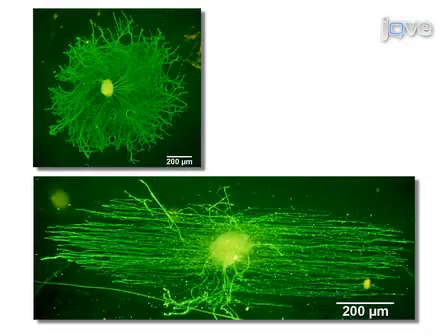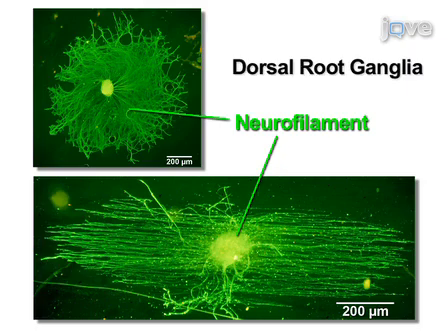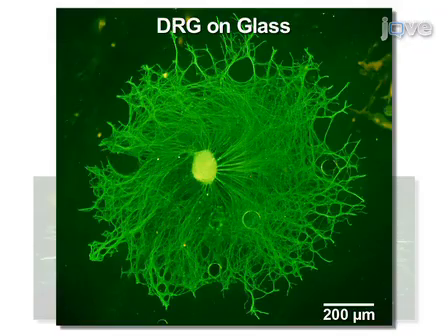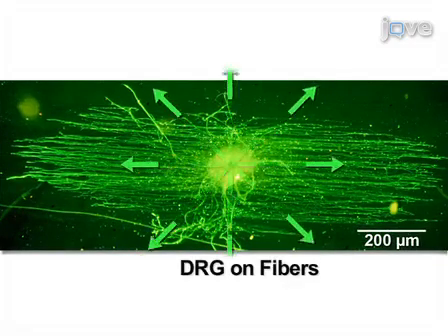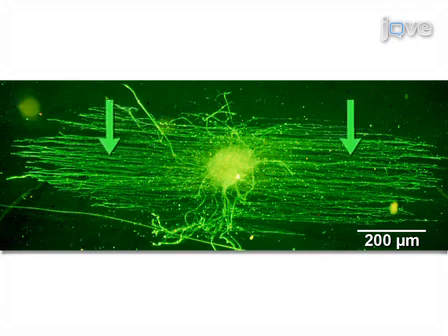In these images, dorsal root ganglia are stained for neurofilament, shown in green, after 3 days of culture on PLL-coated glass and fibers. On glass, neurites emanate radially from the dorsal root ganglion. There is also significant overlap of adjacent neurites. On fibers, the neurites also emanate radially from the ganglion. However, they subsequently turn and follow the direction of the aligned fibers. There is significantly less overlap of adjacent neurites.